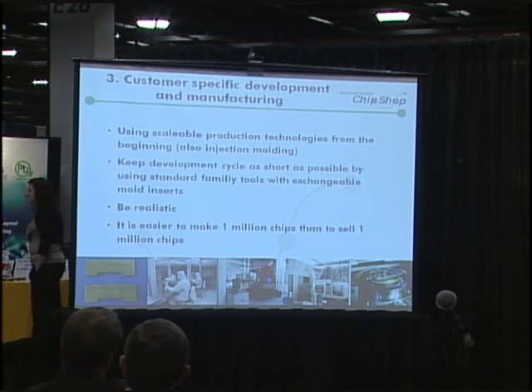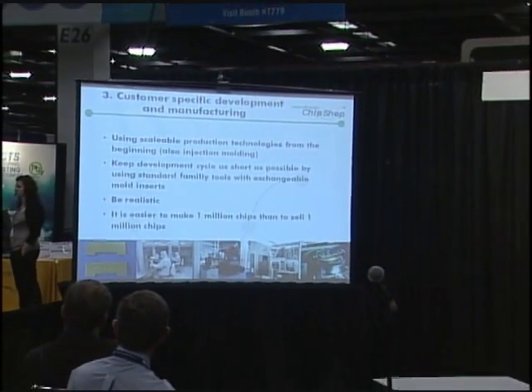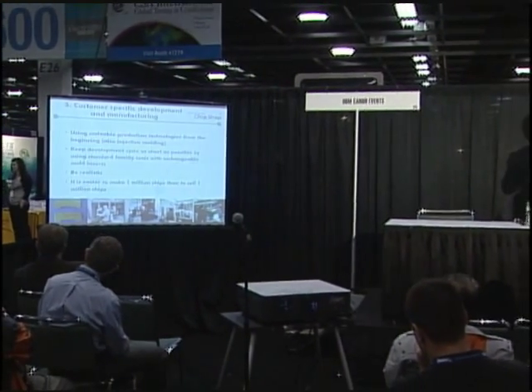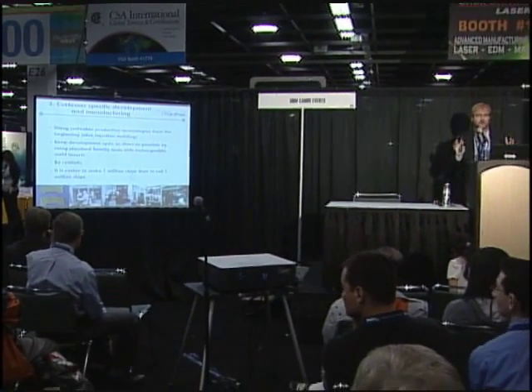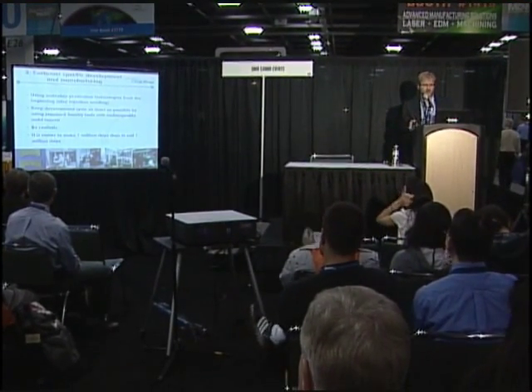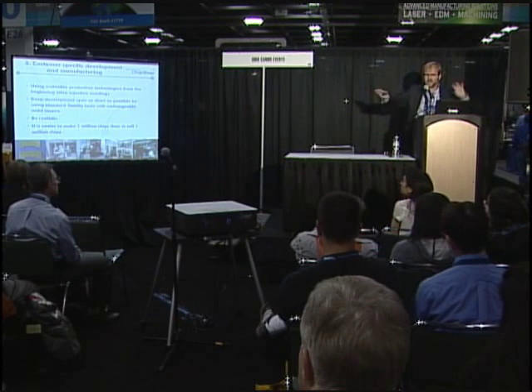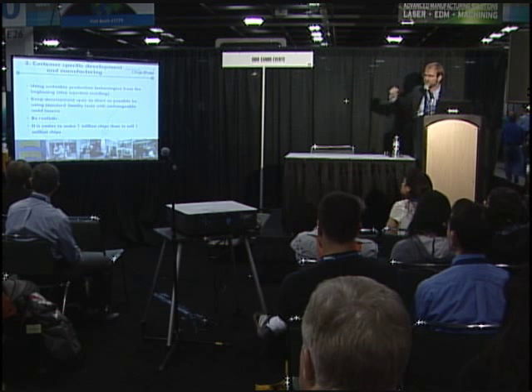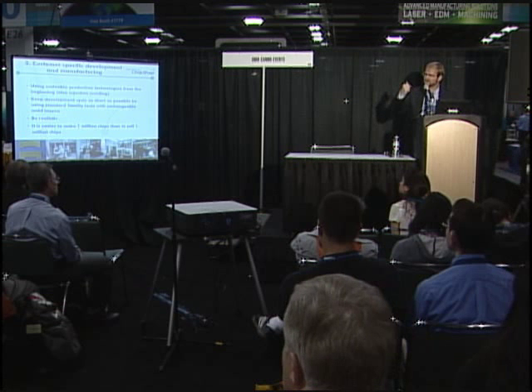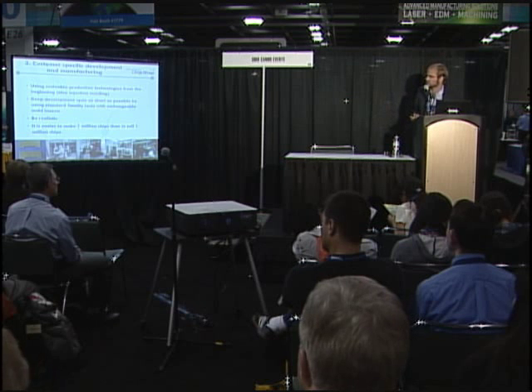The biggest part of our business is customer-specific development and manufacturing. And as said before, one of the things I really think is important is that you use scalable production technologies right from the beginning, and for us that basically means injection molding. To keep development cost and cycle time as small as possible, we use family tools, so we have a fairly broad range of sizes and interfaces available with exchangeable mold inserts. Typically for your first couple of development steps you would only have to invest in a mold insert, which typically is about an order of magnitude cheaper than a complete injection molding tool.